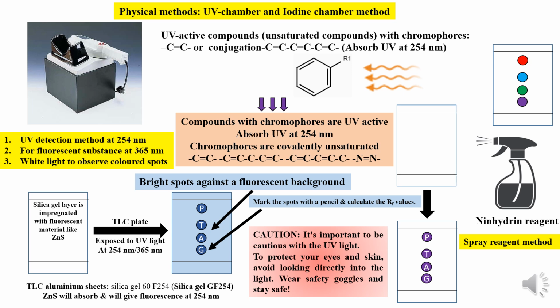An important caution. It's always important to be cautious with the UV light. To protect your eyes and skin, avoid looking directly into the light. And better you wear safety goggles and stay safe. And avoid exposing yourself to the UV light.